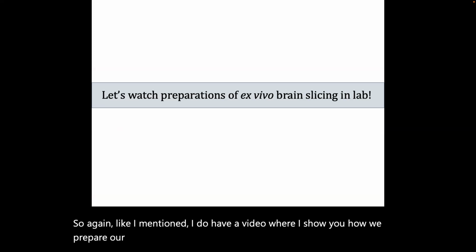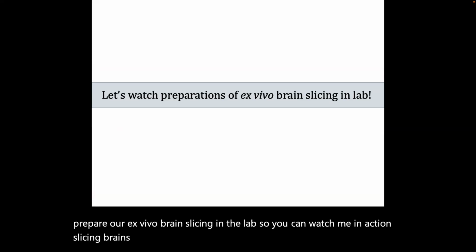So again, like I mentioned, I do have a video where I show you how we prepare our ex vivo brain slicing in the lab. You can watch me in action, slicing brains, and you can really see how these ex vivo models are prepared.